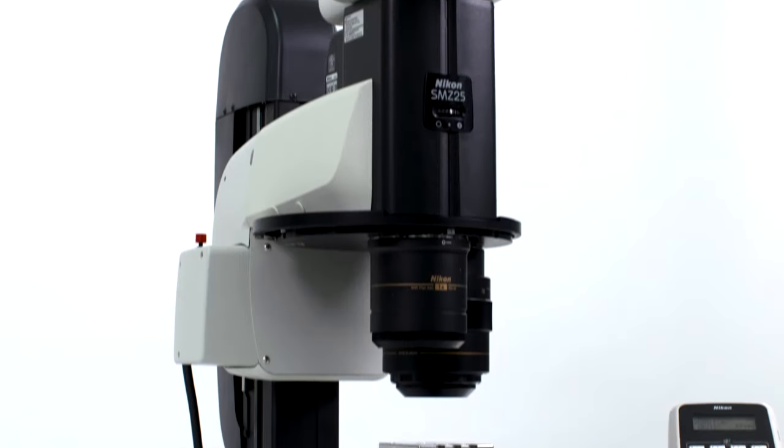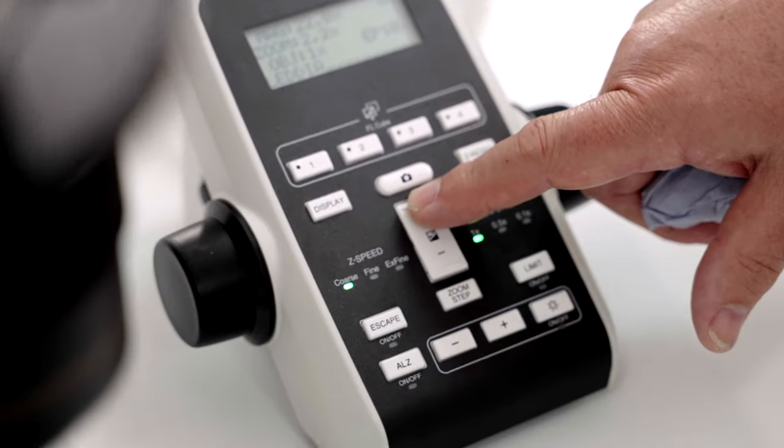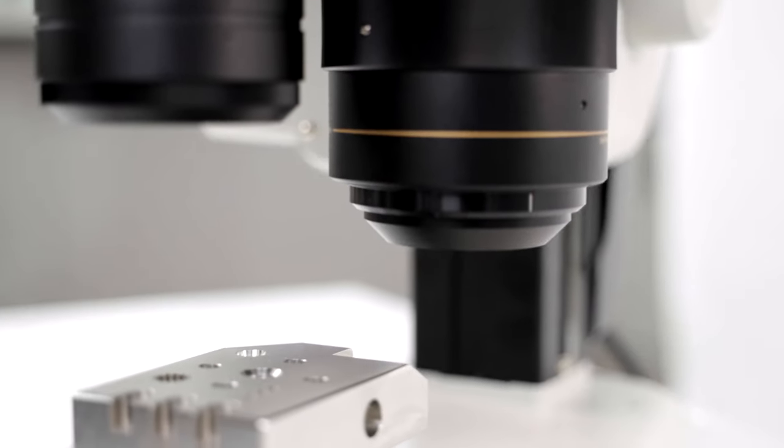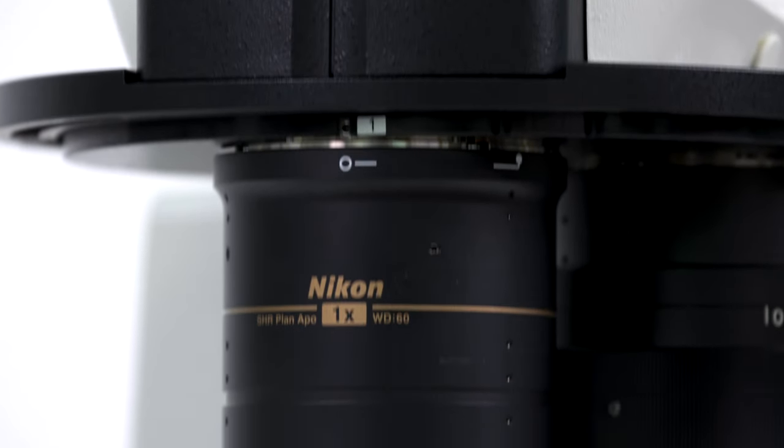The SMZ25 is a very special microscope indeed — it stands out clearly from the crowd. Firstly, it has a zoom ratio of 25 to 1, which is far ahead of any other high-end solution available. In fact, this is nearly 25% more zoomed than the previous world leader for a stereo microscope zoom ratio.